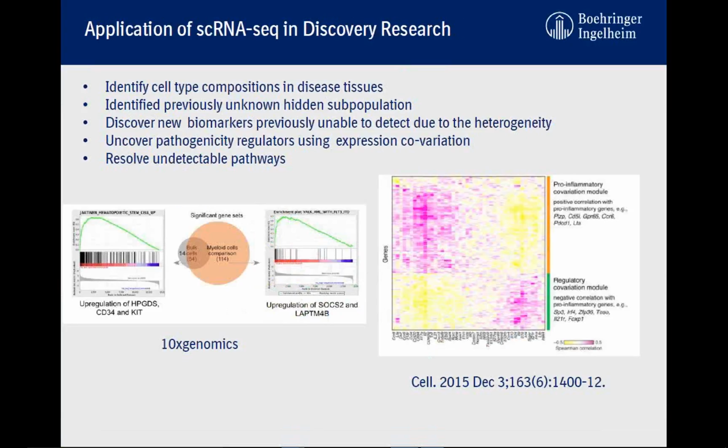Discovering new biomarkers. If we really deep sequence the samples, we are truly able to utilize the clinical features in our gene signature to make the connection. For the first time we can identify, for example in lupus, gene sets that really correlate with the flare, and we can correlate the disease activity scores, which is extremely difficult.